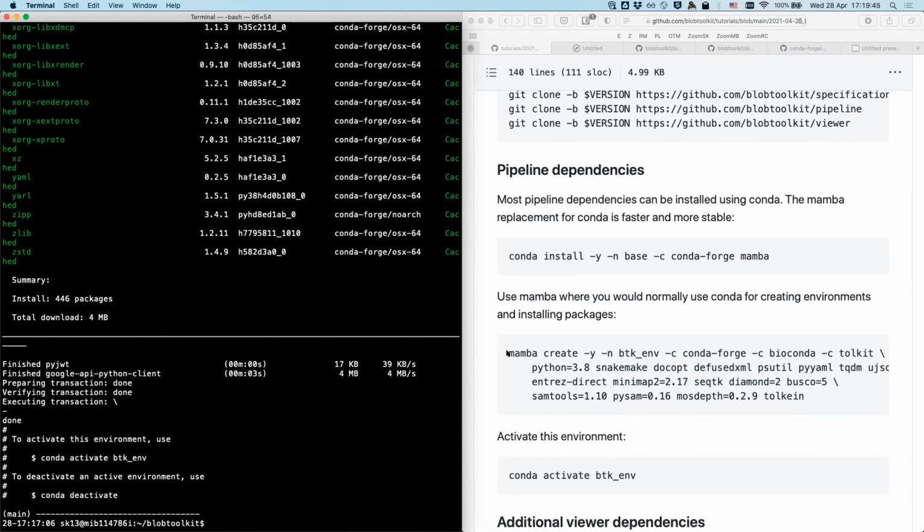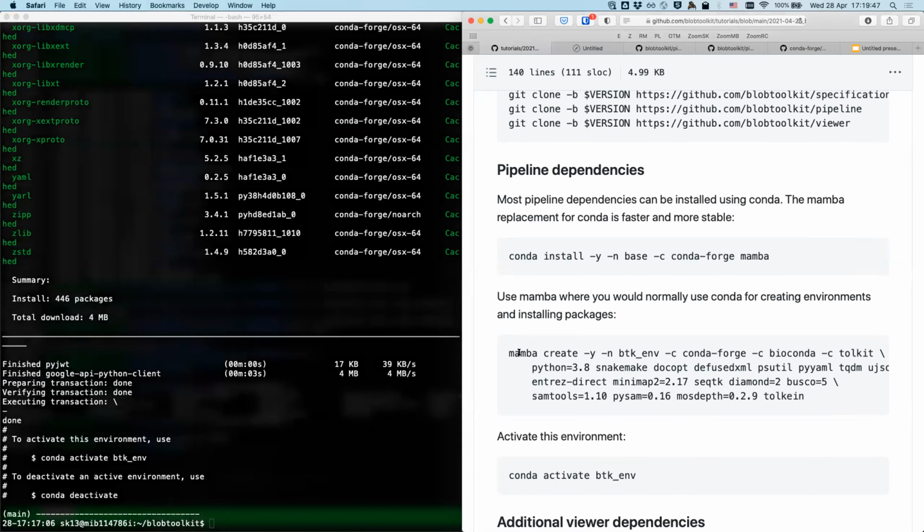Okay. So if anybody has any questions about conda or Mamba, feel free to ask those at any point, because I realize this might be new for some of you. I'm not an expert on conda, but I can tell you the basics of what it's trying to do. The nice thing is that it runs on servers, it doesn't require root privileges, it creates a contained directory environment and makes all the paths relative to that directory. And therefore, it's just a nice way of packaging everything up.